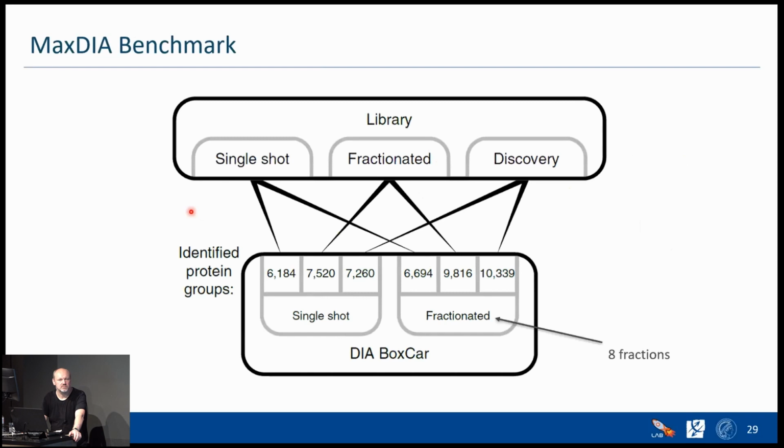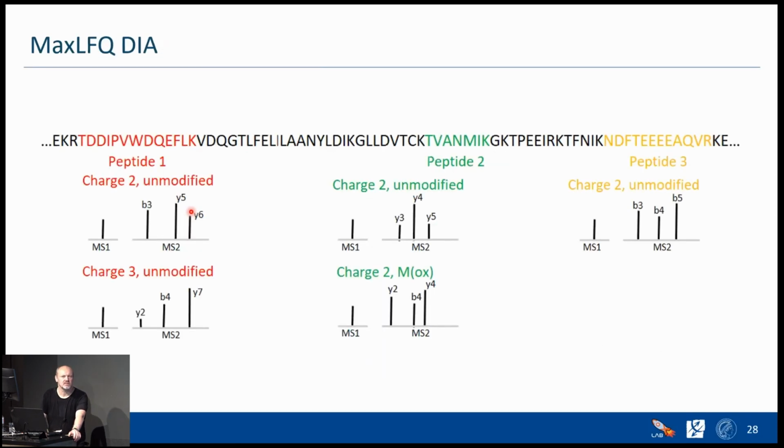Okay, so that answered your question. Are there more? Question: I just had one question about whether you can get a ratio on the peptide level, or is this only rolled up into a protein level ratio?